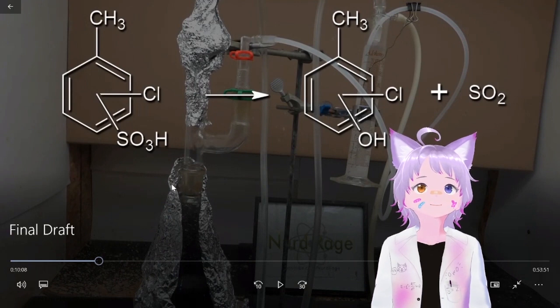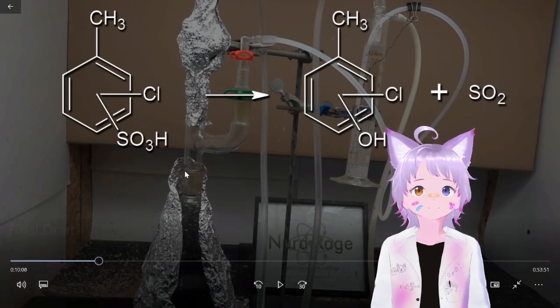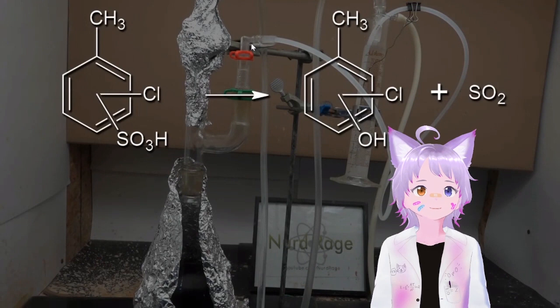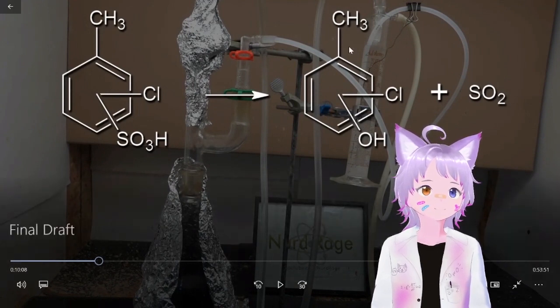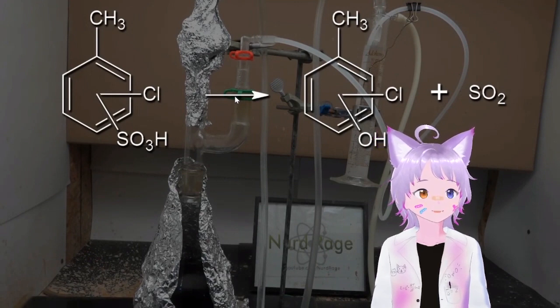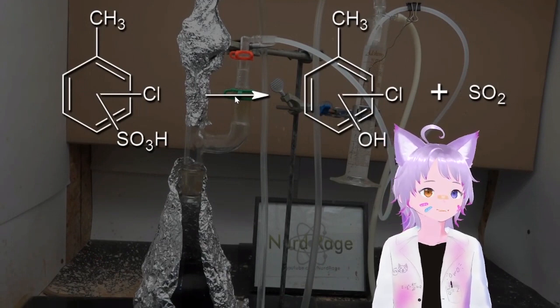Also, we don't have to set up this complicated setup because I think it's just a Dean Stark, right? Or a Clevenger. What is he using exactly for this? Is it a Dean Stark though? Because we don't have to copy this setup. We could just straight up use a Dean Stark apparatus. Yeah, this is a Dean Stark, just a homemade, makeshift one. And I think he's just removing water from the reaction, so a regular Dean Stark apparatus would technically work, replacing all this mess.